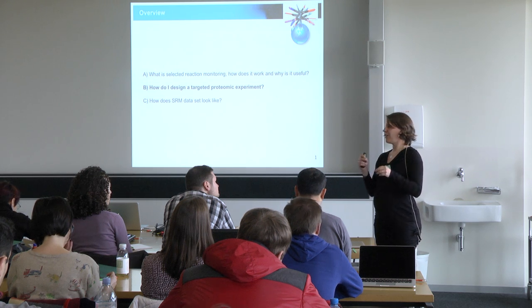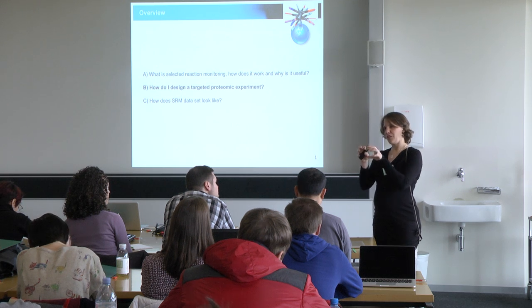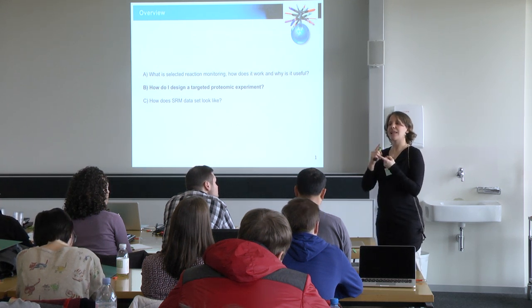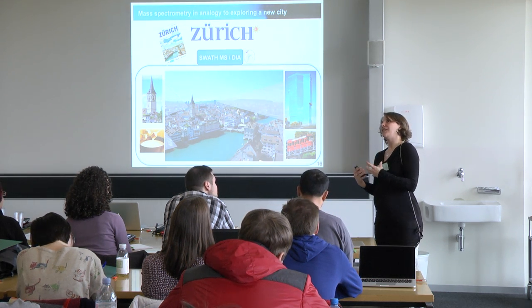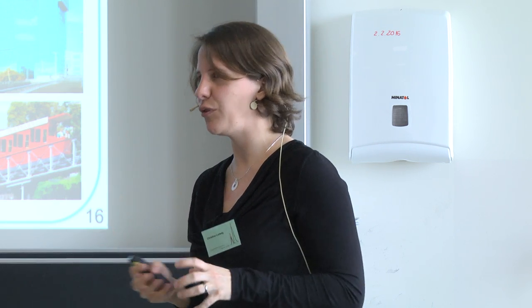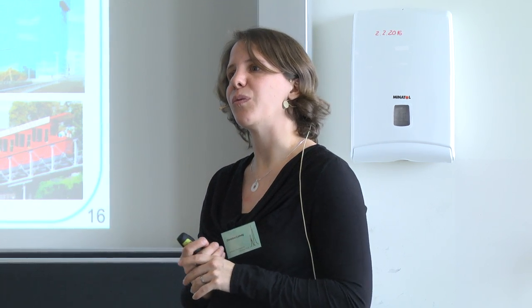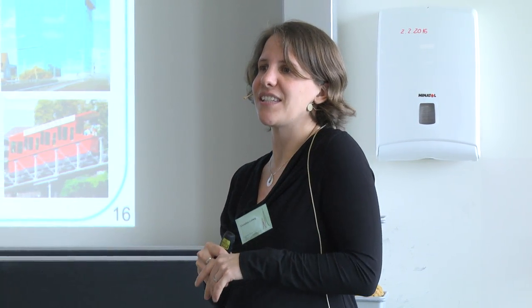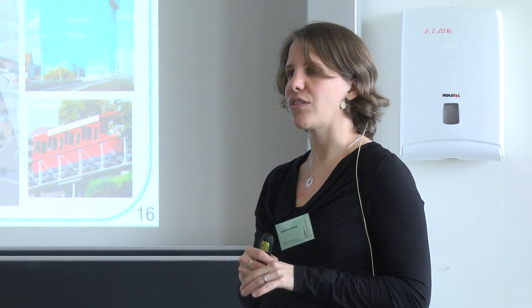If you want to have the optimal assay super defined, you can optimize per transition or per peptide these parameters like dwell time, also collision energy, and so on and so forth. But often this is something that you do when you are really interested in having the absolute optimal assay for just very few peptides over many, many samples. So it's a bit of a trade-off what your assay is about. But usually in most scientific projects you take the average peak width, this defines your cycle time, and then you apply this constantly to all of your transitions. Okay, thank you.